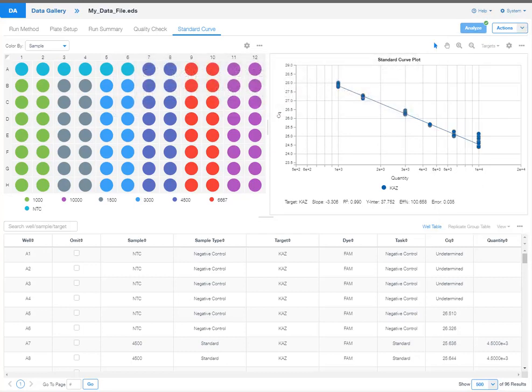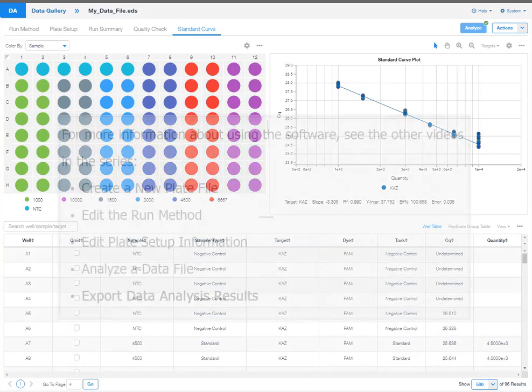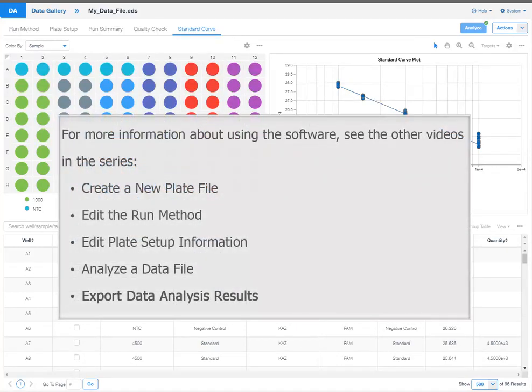This concludes the Analyze a data file tutorial. For more information about using this software, including exporting the data analysis results, see the other videos in the series.